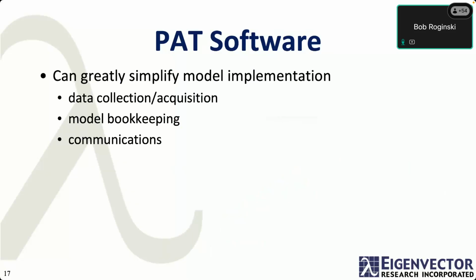Again, keep in mind the scenario where you have multiple models per measurement point. It's going to be very helpful for you to be able to get that done. And then the PAT software will have the necessary communications to tie into your infrastructure, whether it be in a lab scenario such as a LIMS system, or in the plant with the different types of protocols that are in use out there.